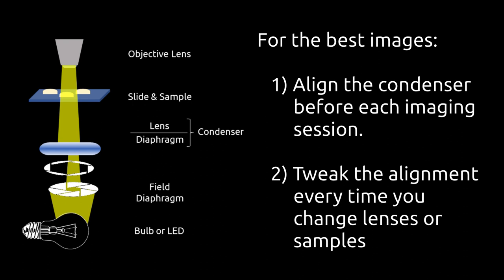After changing lenses, simply close down your field diaphragm and make sure that it's focused and centered. And if it isn't, make the adjustments you need to bring it back into position.